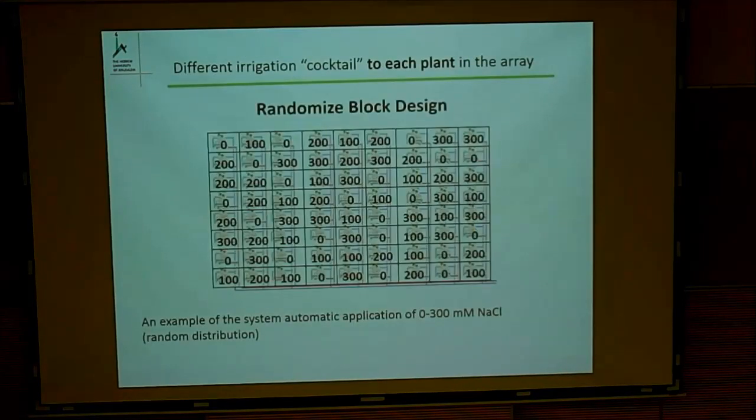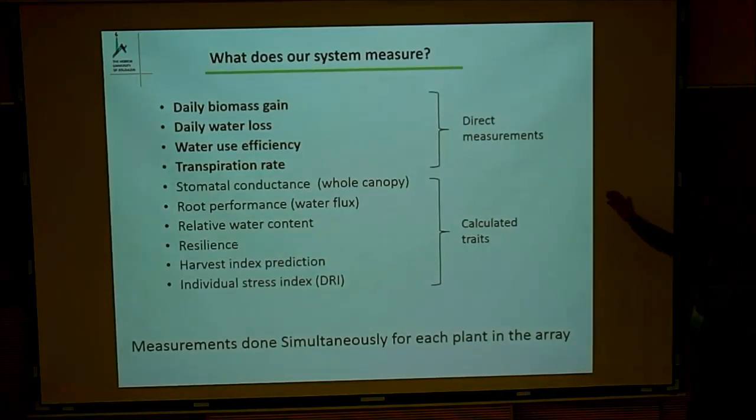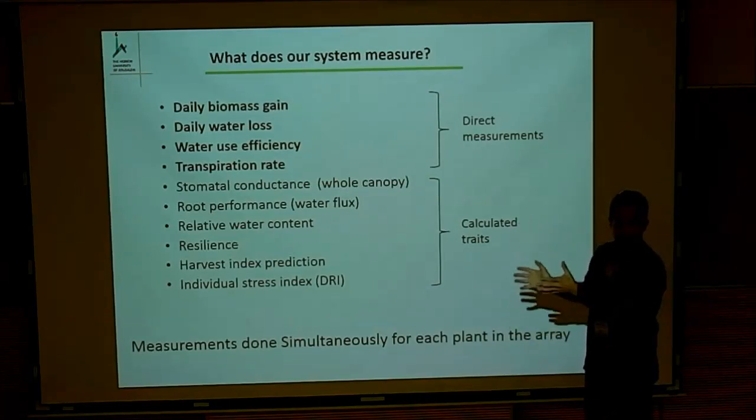So the idea is that each plant can have its own solution in a truly randomized block, so it can really work very nicely later with the statistics. What do we measure? As I told you, it's with no imaging processes. Everything is with the system I showed you.